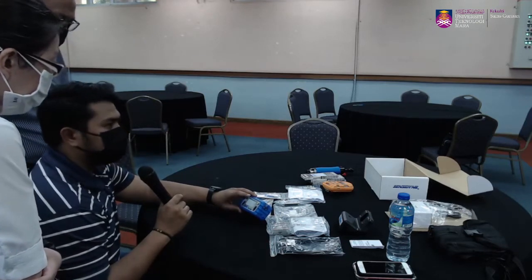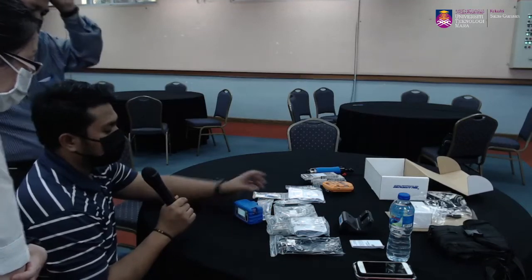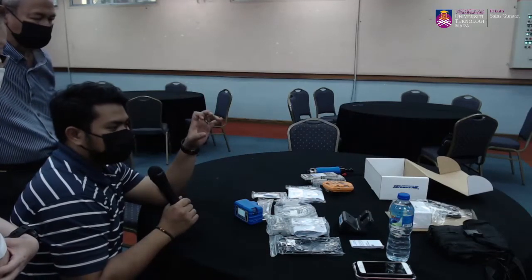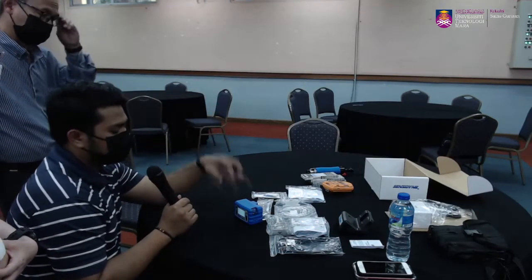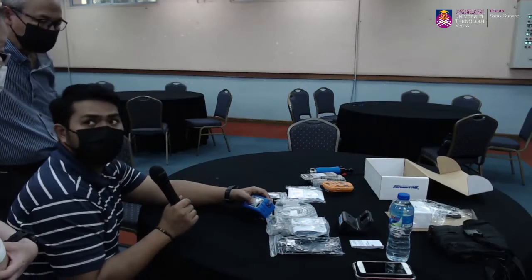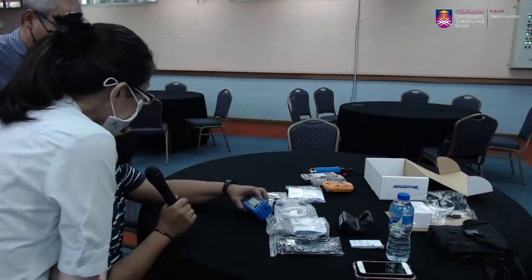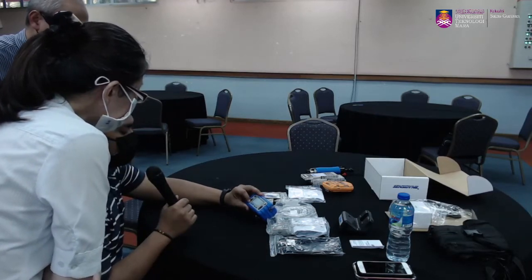So CF meaning in terms constant flow lah. Meaning that in terms of kalau kita pakai kita punya all of kita punya sampling media. So kalau contohnya kita pakai various ada dual charcoal tubes. So kita kena pakai that accessories dan kita kena tukarkan kepada dia punya correct control flow lah. Constant flow, sebab kalau kita tengok in terms of setup dia ada beberapa which I will go through the slides yang dia ada in terms of kita boleh setkan dia punya flow mode dia lah.